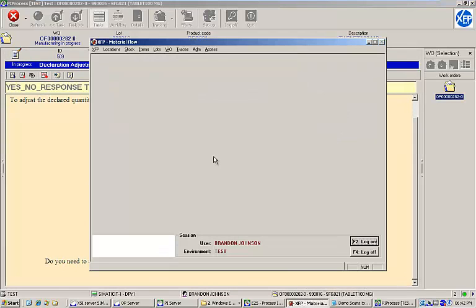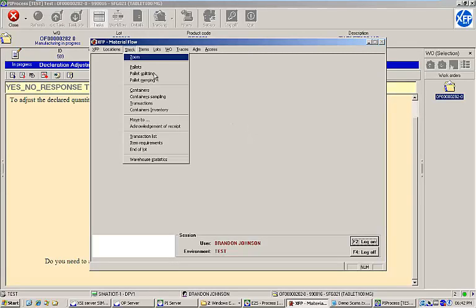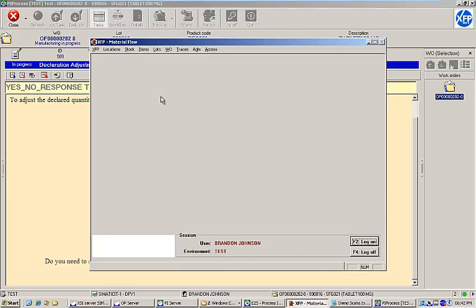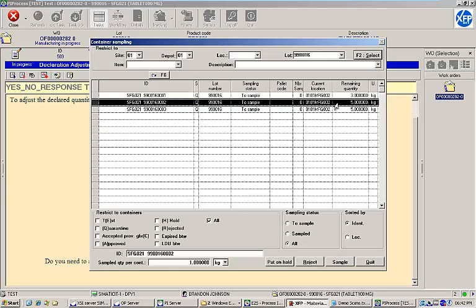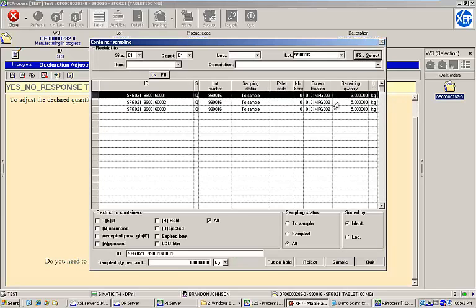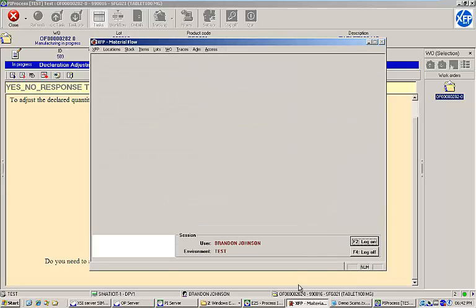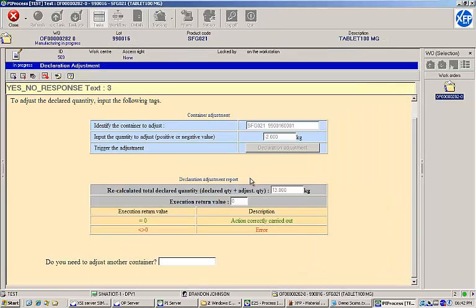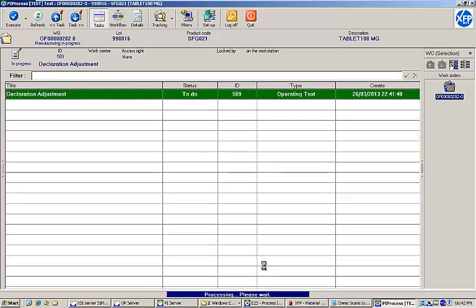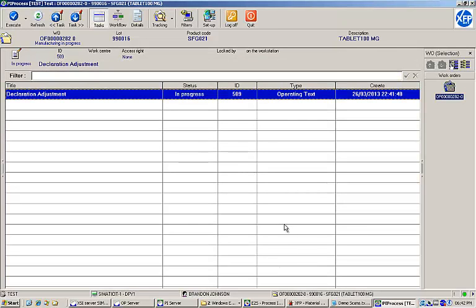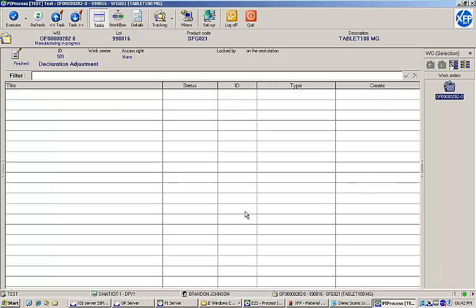When we view our container inventory again, we can see that the container's quantity was automatically adjusted down to three kilograms. Let's complete the adjustment task and move on to our final step.